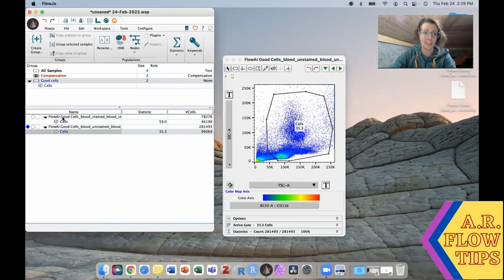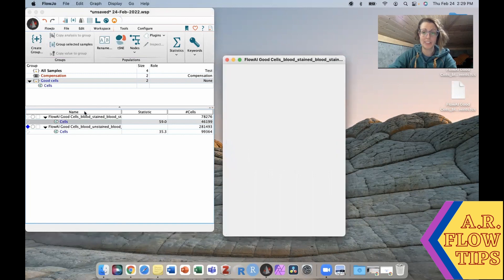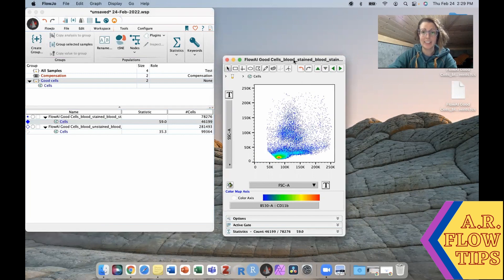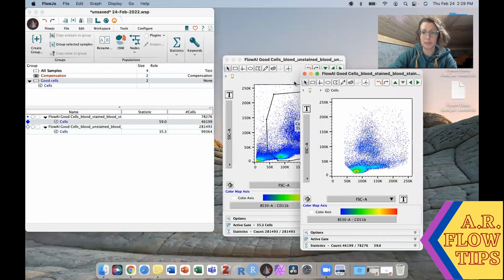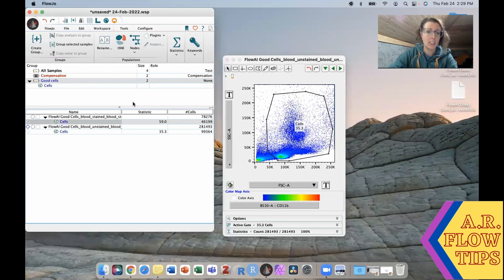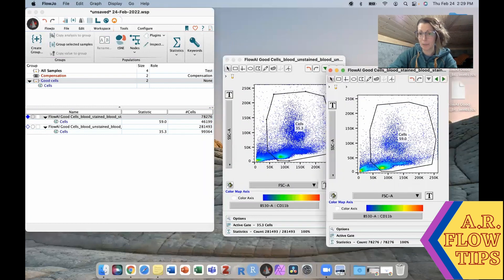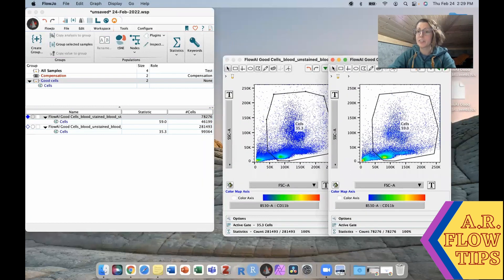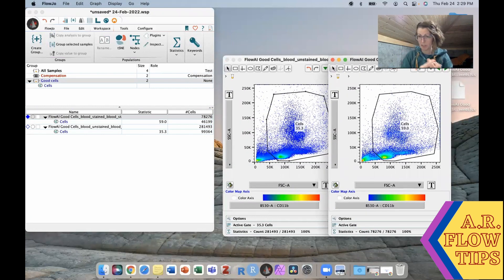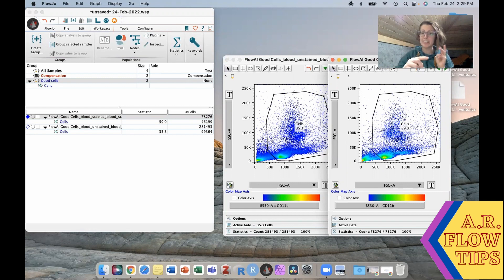So both of ours are then gated with our cells gate that is going to exclude the debris and the clumps. So we've removed bad events, we've removed debris and clumps. Next step is to remove any doublets.